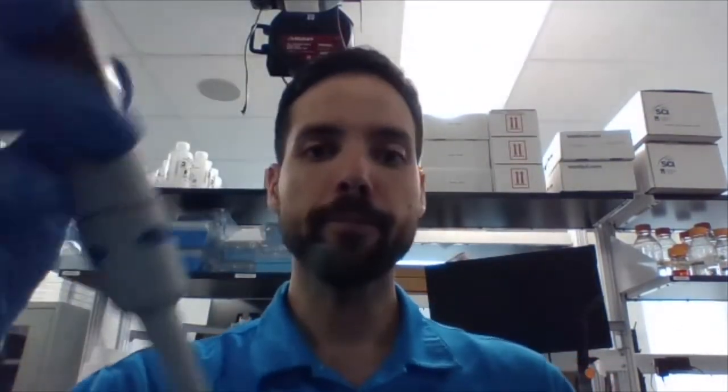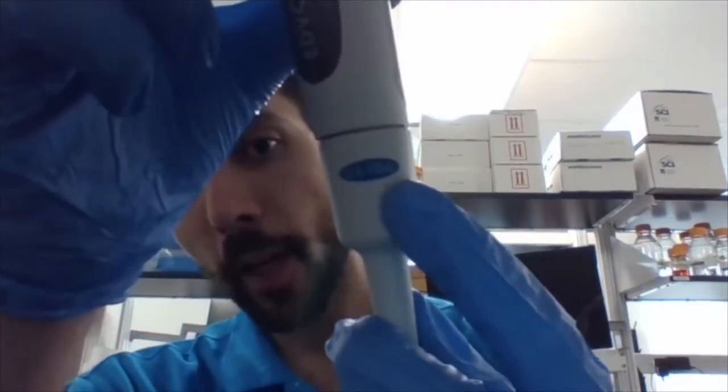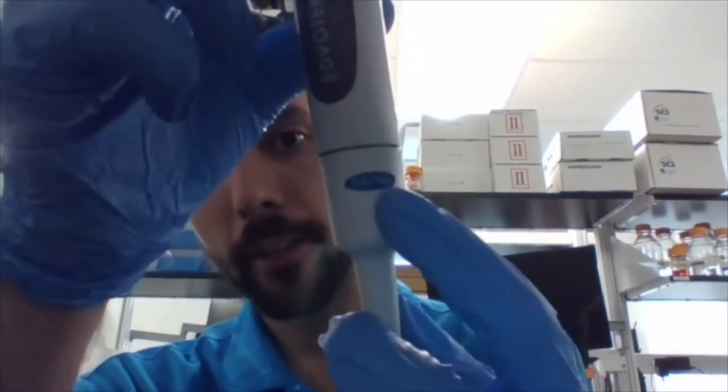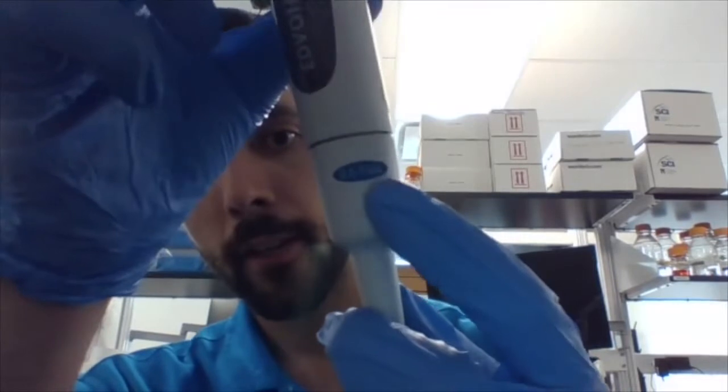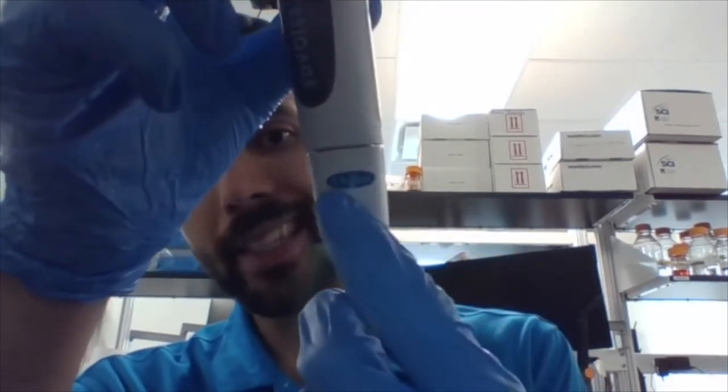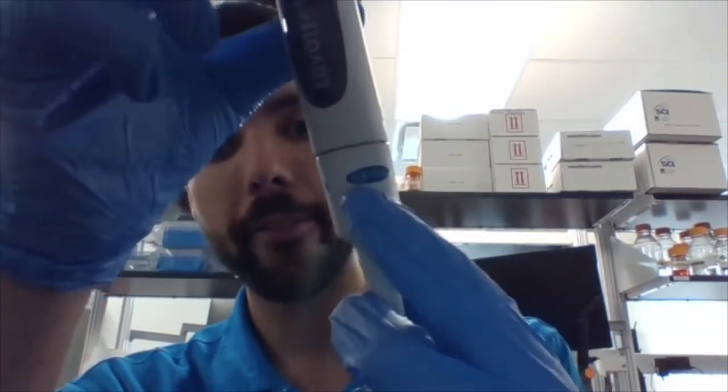And then I have my P100. And my P100, it says that the maximum volume it can pick up is 100. The smallest volume it can pick up is 10 microliters. And then I have my P10. P10 refers to the maximum volume I can pick up. The most I can pick up with it is 10 microliters. And then the least I can pick up is 0.5 microliters, so half a microliter.